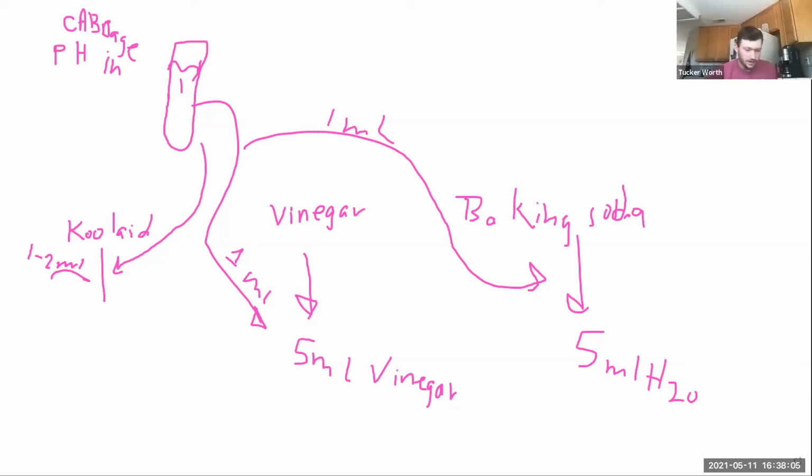Okay, thank you. Should the vinegar be like a 5 or a 6 roughly? The pH of vinegar should be around a 3 or 4. Okay, I'll just do a quick test again, because how long are you supposed to leave it?